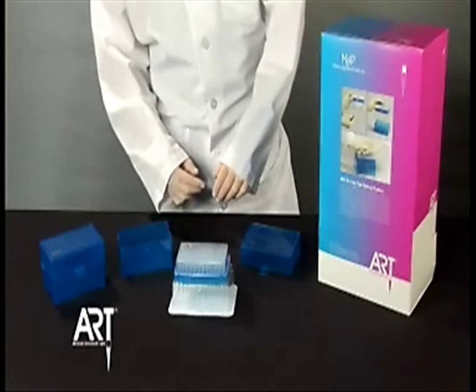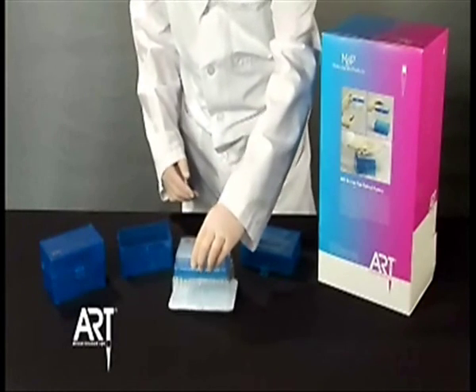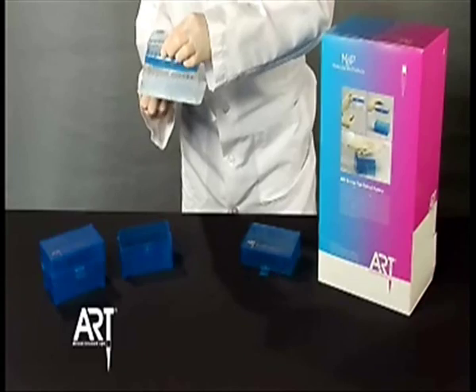When you're ready to begin using your Art Reload system, take the blister tub, holding it from the top, and peel away the paper bottom.